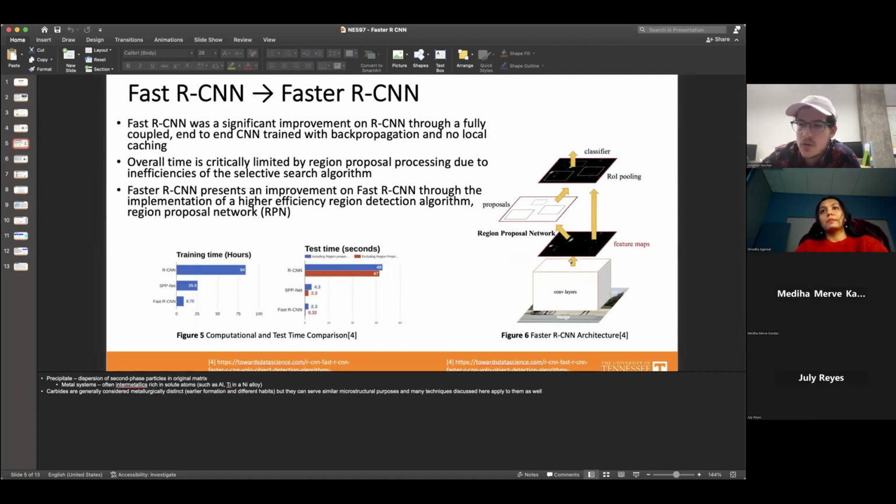So you have the convolutional layer where it's transformed into a feature map, and then you can see at the same time that your feature map just passes straight to the region of interest pooling, but at the same time, you're having your RPN generate your region proposal maps, and that's what's isolating features in the feature map. And from there, it goes to the final classifier. Right. And this is ROI pooling, and in ROI pooling, they are trying to again condense all the features further. Exactly, yeah.